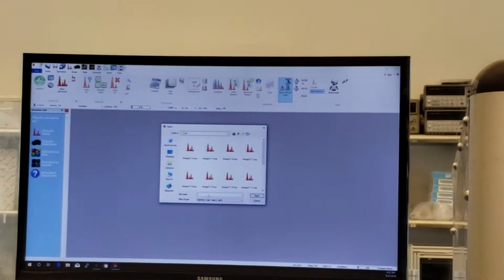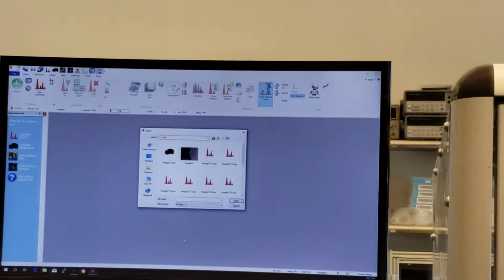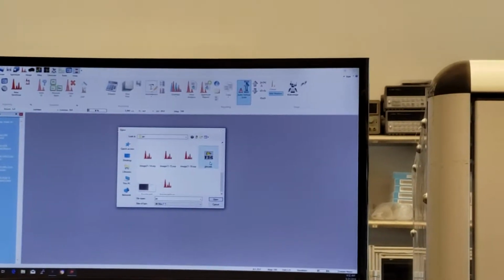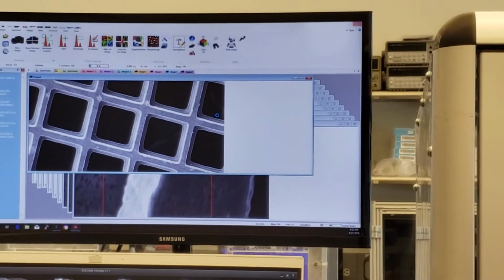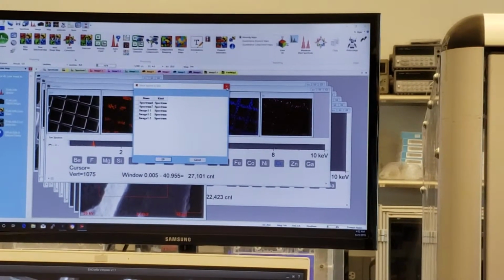I can go back and go File, Open, and I'm going to select all the files, and I'm going to find that Jim, wherever it is in here. Here it is, Jim. See Jim? Double click on him, and here comes that whole job that you just did. That's pretty nice. So you just saved and you just recalled that whole entire job, which is kind of nice.